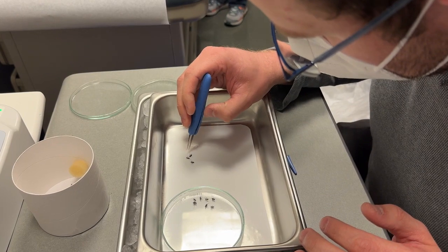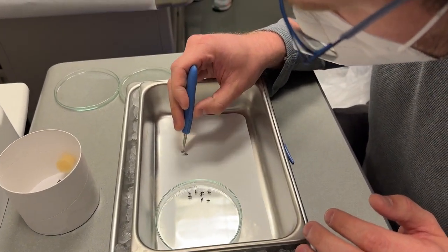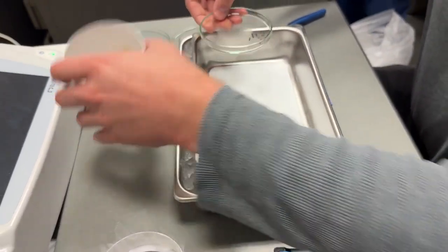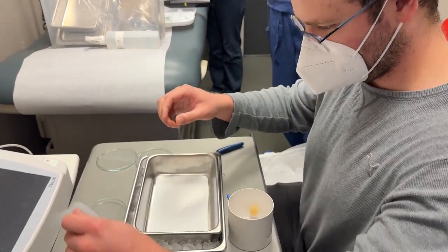Thankfully, these mosquitoes pose no risk of transmitting infection at this point. Even if they did consume infectious blood, it takes between 10 and 14 days for mosquitoes to become infectious. So they're going to go into this little cup and we're going to seal it up.